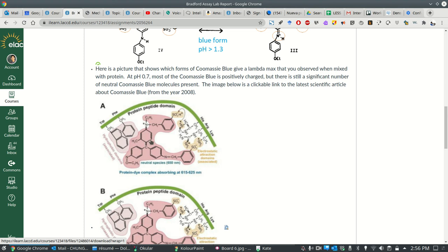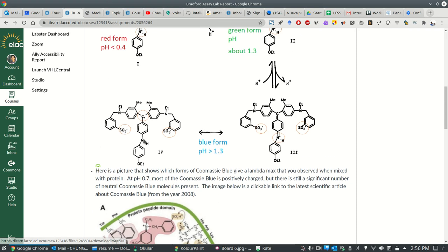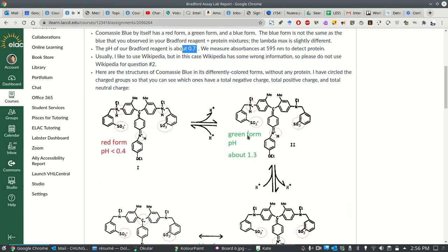All right. So what that means is, when this complex forms, that means one of these molecules has disappeared. It has formed a complex instead. It is, for all practical purposes, a new chemical. Now, it's technically not a new chemical because no chemical bonds have formed, but for all practical purposes, they're stuck like that. All right. So that means one of these is gone.